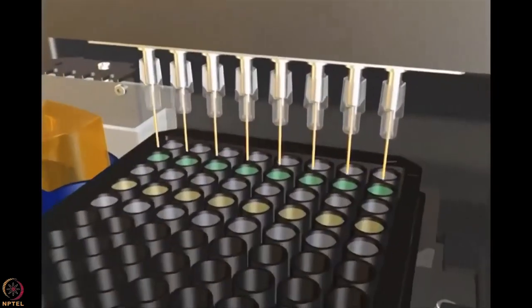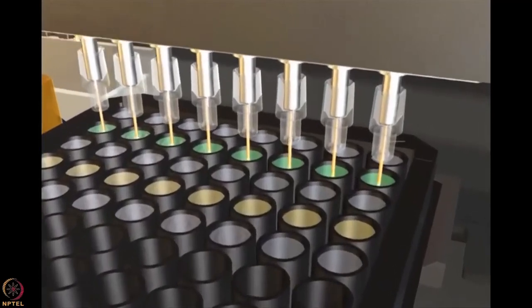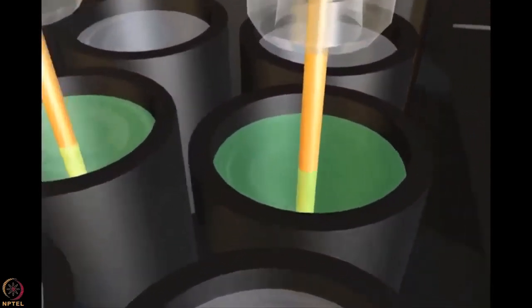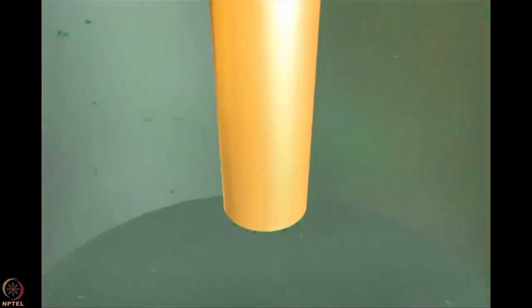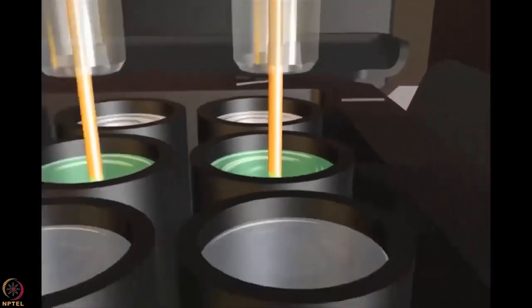The streptavidin sensors are loaded by transferring into the wells with biotinylated protein. Bio-layer interferometry is insensitive to changes in refractive index or pH of the matrix. When more molecules bind to the streptavidin layer, the optical thickness of the layer changes. And as the thickness changes, the interference pattern shifts.